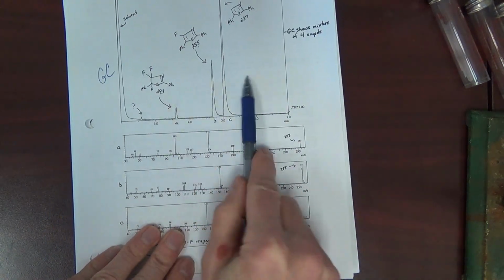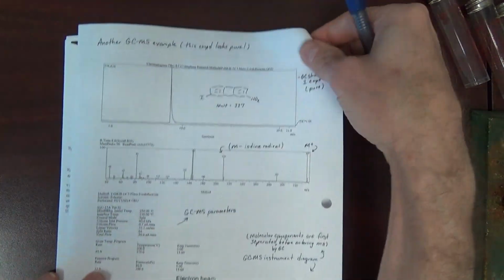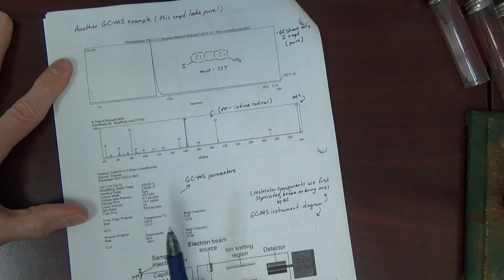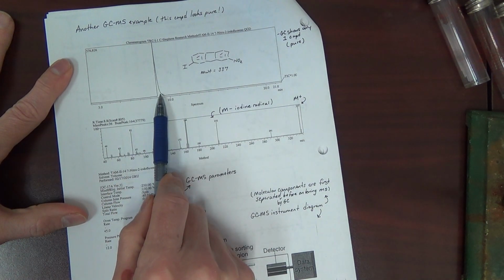Okay, that's G. But that was a mixture, not pure. The next page I show you a GC mass spec of a pure compound. Just like TLC, if you have a pure compound, you expect 1 peak in the GC. All right.